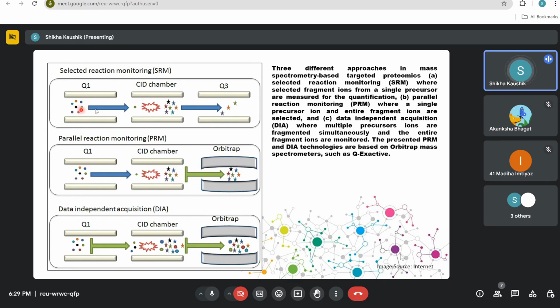So what is happening here? For example, you have these many proteins. You have selected the green one. Now you want to know the details of this green one, right? Then you send it to a second quadrupole system where this particular protein is getting fragmented and ionized, further fragmented and ionized, and then from here also you are selecting a few of its fragments and studying them.